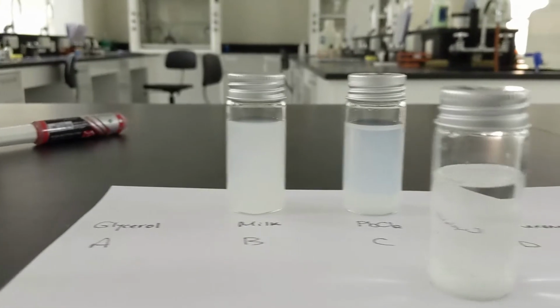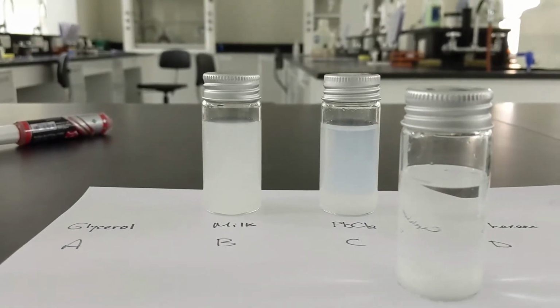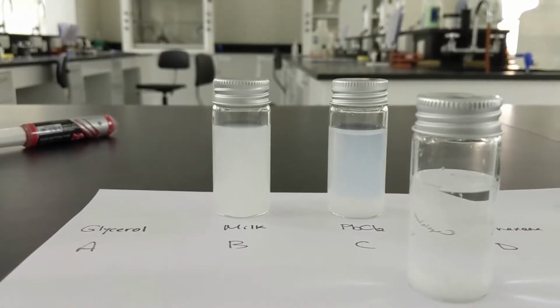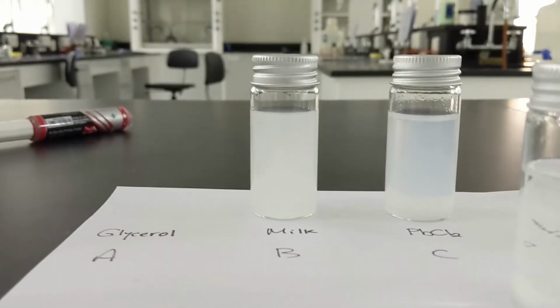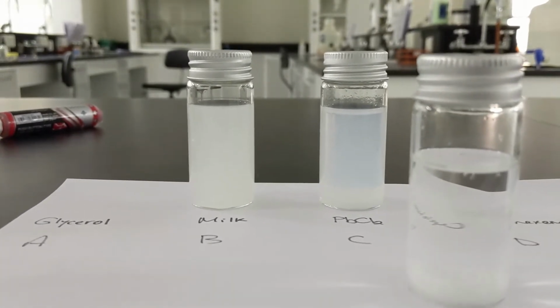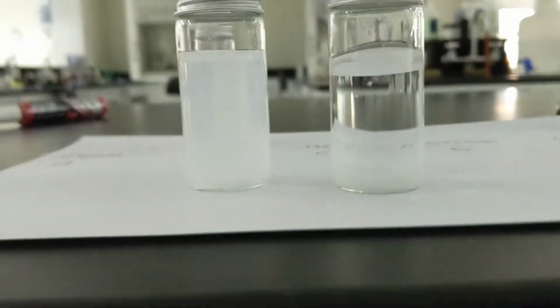Milk, as you guys know, when you go grocery shopping, stays like milk for weeks, or at least days. It's a stable colloid, and that's one of the definitions of a colloid. It should stay stable for long periods of time. So this has been 5 minutes, this has been maybe 15 minutes, and look at the difference. So I can do the Tyndall effect here and just see what's happening.